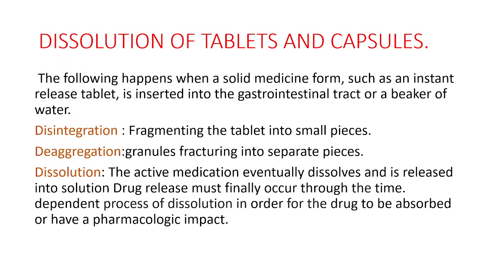So now we are going to see the dissolution of tablets and capsules. The things which are going to happen when a solid dosage form such as an immediate release tablet is inserted in the gastrointestinal tract or a beaker of water: disintegration is the first one.